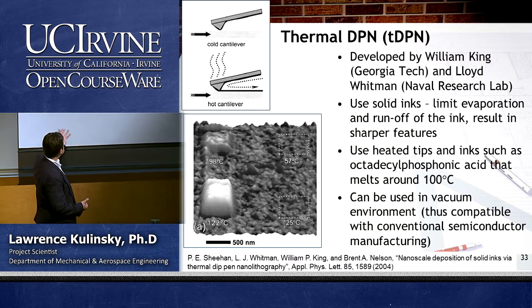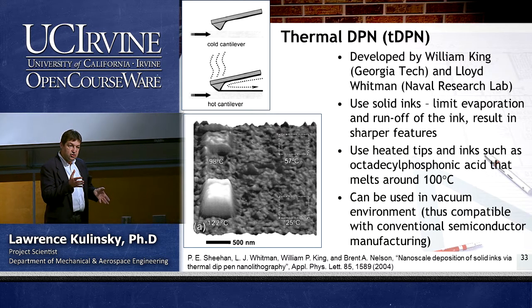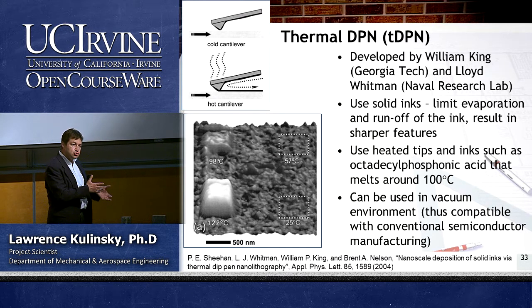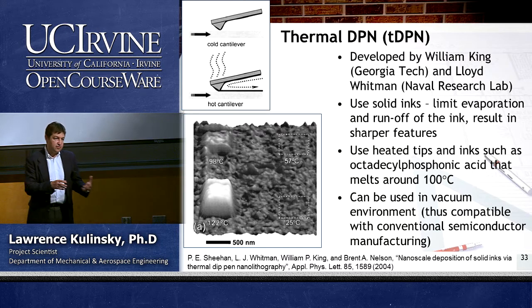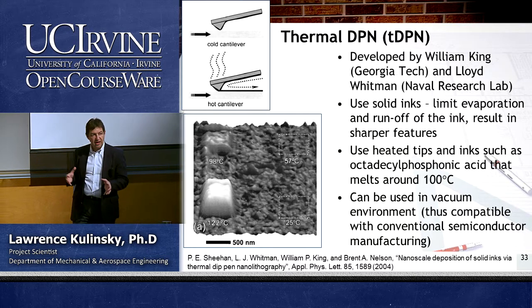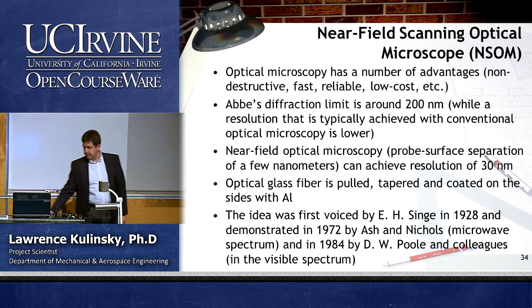So using thermal DPN, you can also use it in the same environment where you use your conventional semiconductor processing. They have a lot of exposure to vacuum environment. So with this technique, you also can have it in vacuum as well, if you want. Okay?